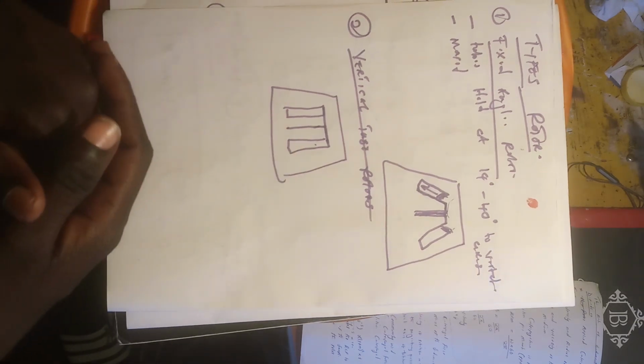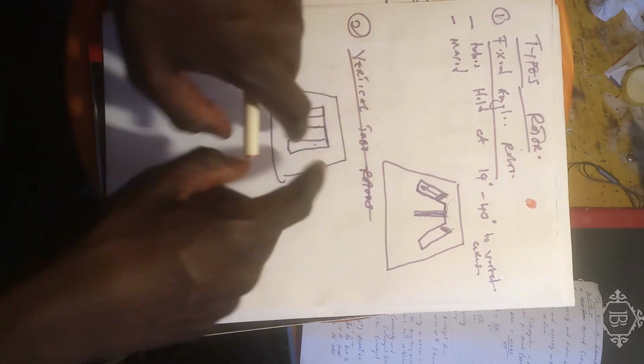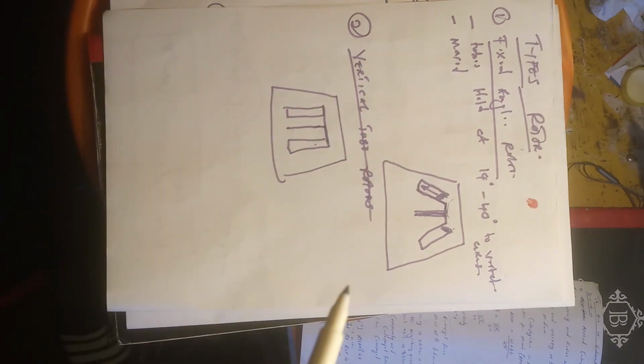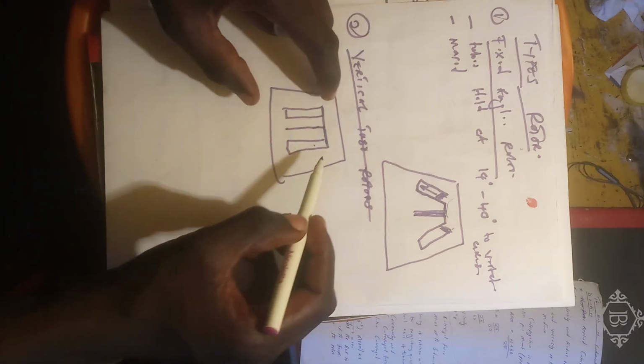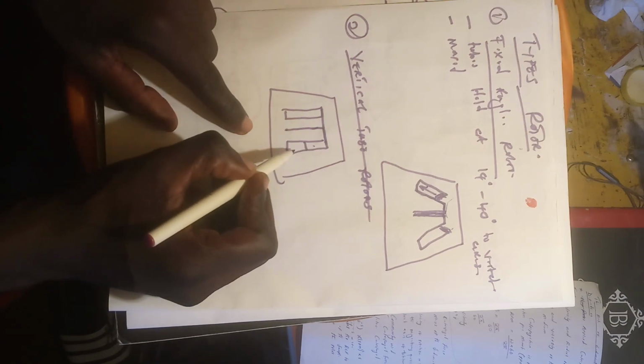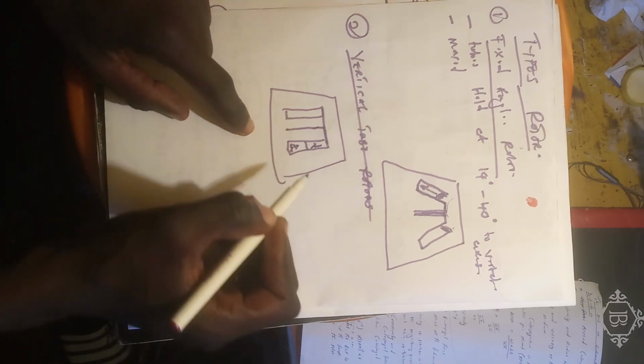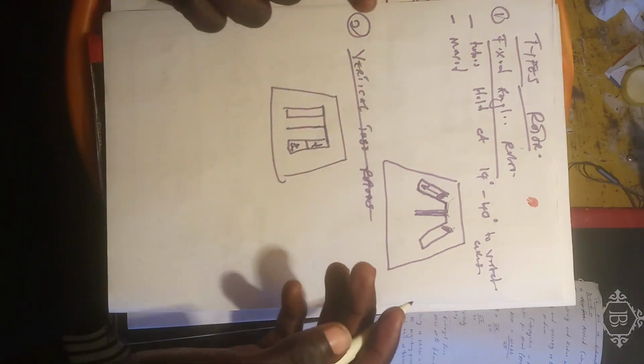and the separation takes a short period of time. But the limitation in using vertical tube rotors is that just after performing the centrifugation process, since tubes are held like this, there is a possibility of the supernatant and the pellet remixing after stopping the centrifuge.